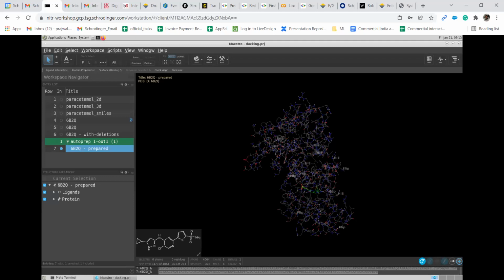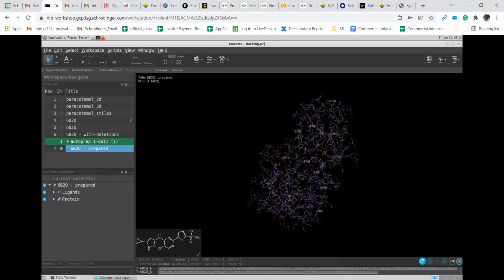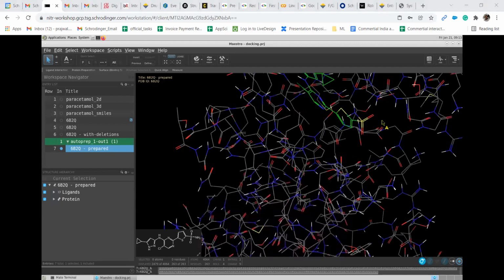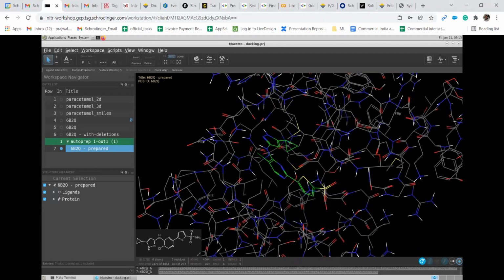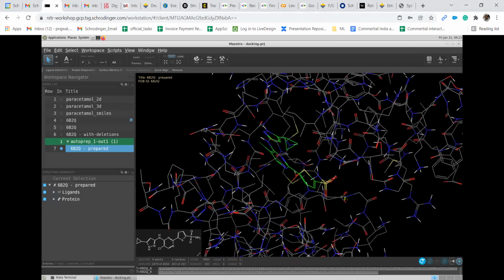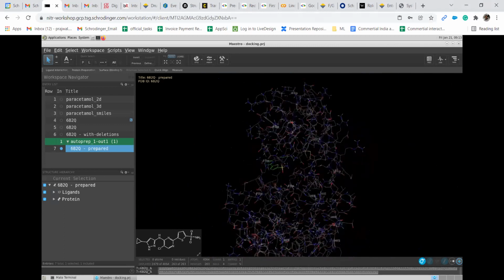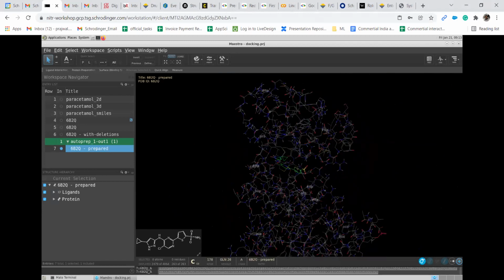So first thing is, your protein structure has a ligand inside it, and that ligand is the inhibitor molecule for the protein structure. And you get this information from the paper which is present for this particular protein structure. So you just need to read that paper to get the idea of it. So once you come to know there is a ligand molecule, inhibitor molecule, present inside the protein structure, straight away we are going to use that information for defining the binding pocket for this particular protein.